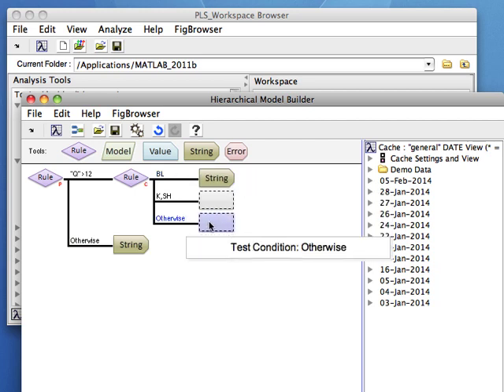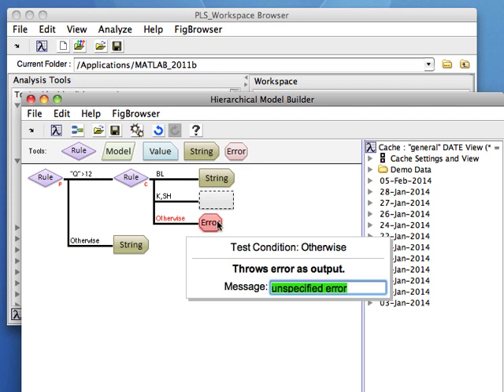And otherwise, I'm going to do that branch here. I'm going to throw an error for that. And I'm going to say error. And my message is here, out of BLK SH mod, and that is the error that we're going to get if we're outside the Q and T squared limits of that model.